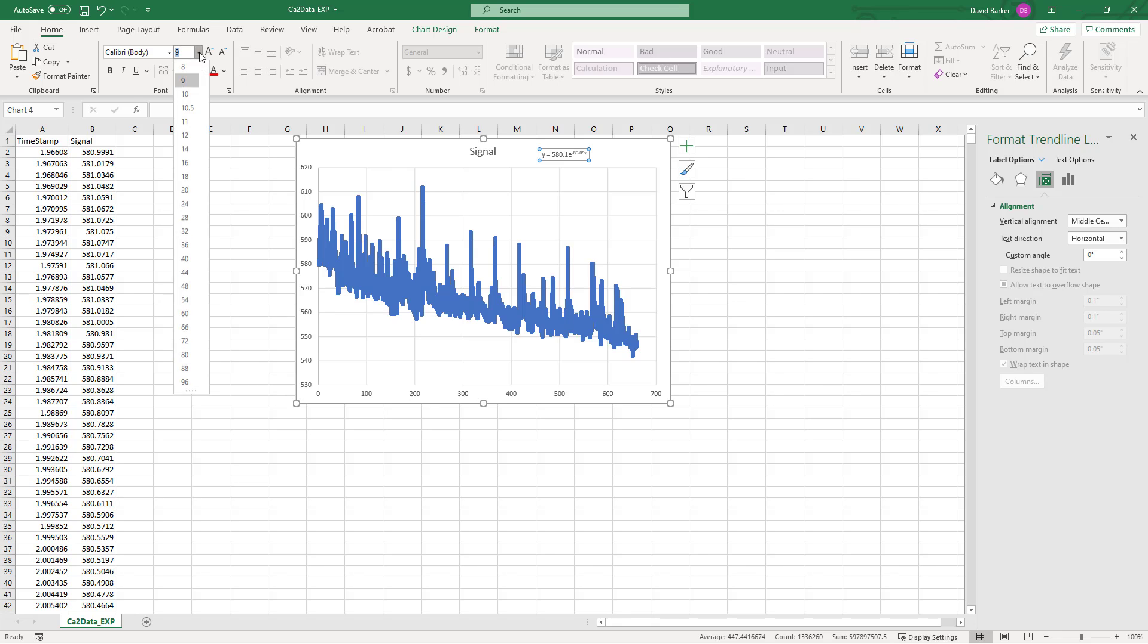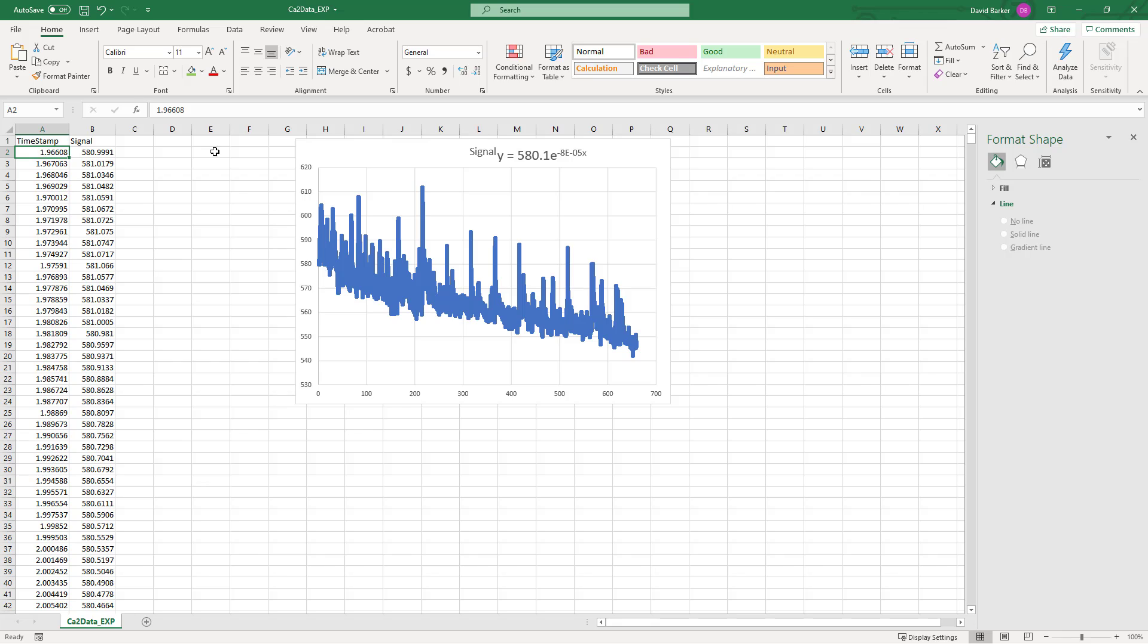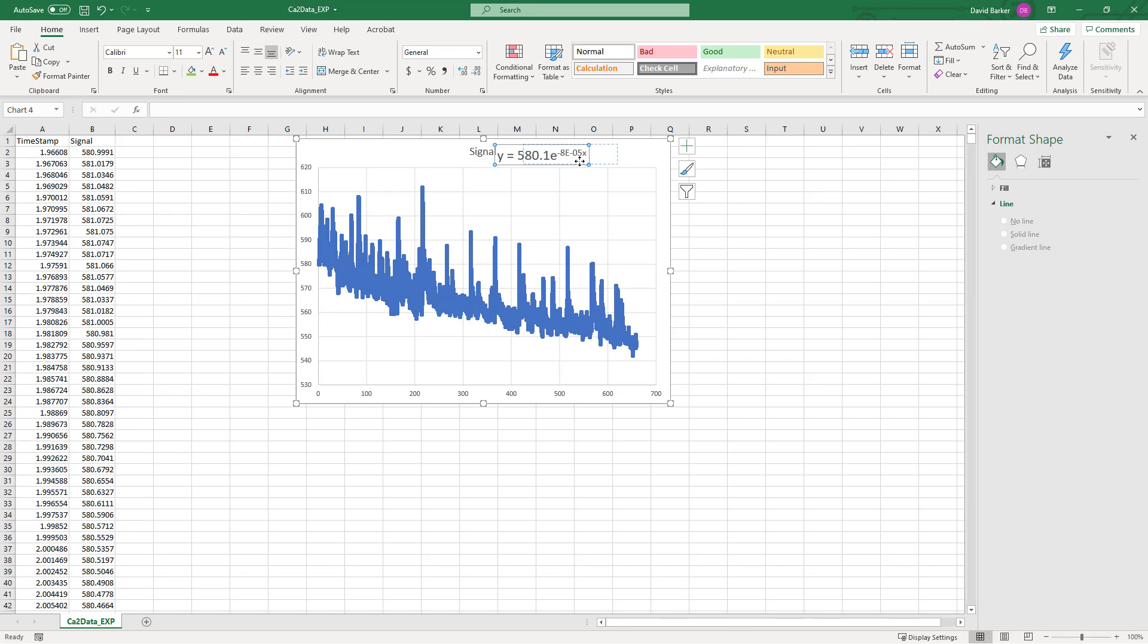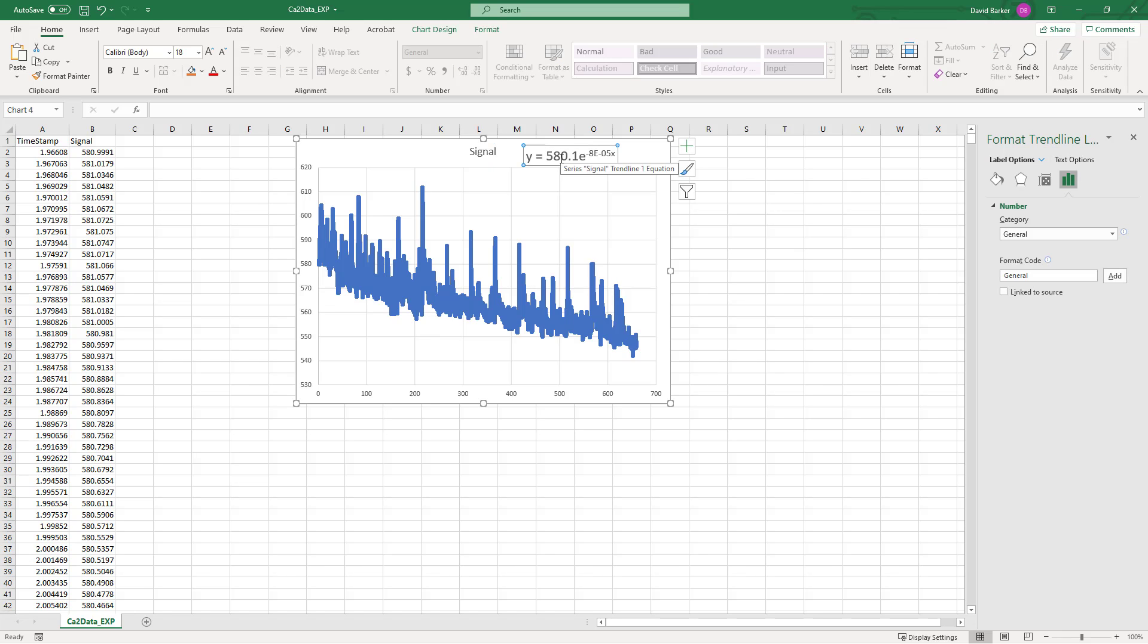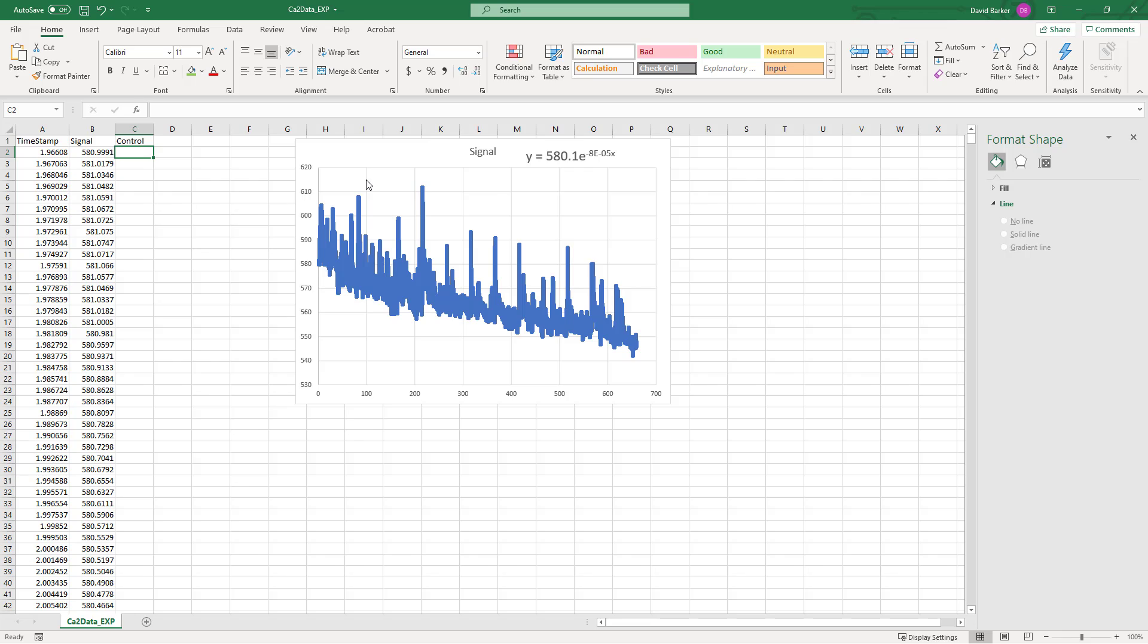So what we have is, if we're using our timestamp data here as our X in order to predict our signal data, we have this exponential line that's predicted by the equation that you see here. Now we can actually use this to generate some control channel data, and what this is going to do is it's going to be the best fit across our data here using an exponential curve.